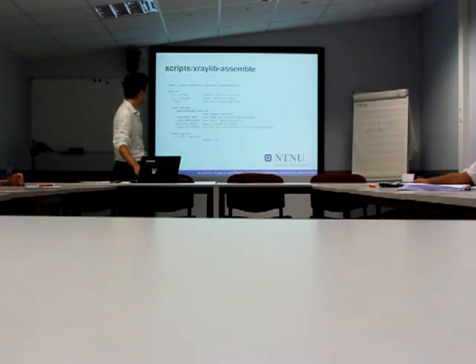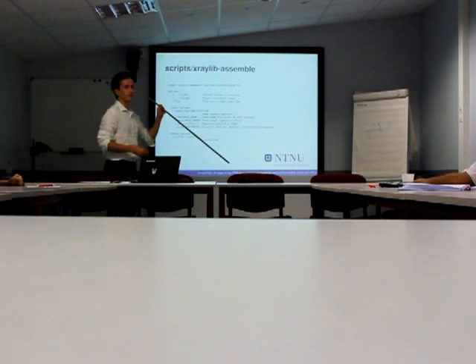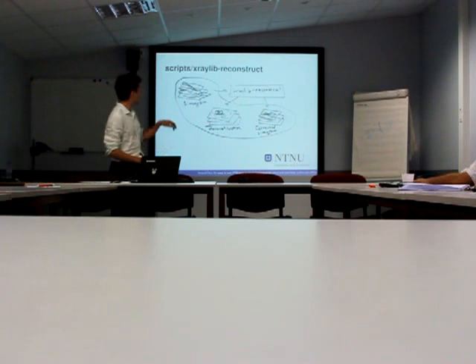Again, it should be quite simple to use this. You can specify one peak on the command line with a position and shape and width, or you can specify a file with peaks exported from Dawn. So then you should have some hopefully nice sinograms. You can still do some corrections on them, which you have another script to do. And finally do the reconstruction. And all this is stored in the same file, grouped into groups, so it's easy to navigate.